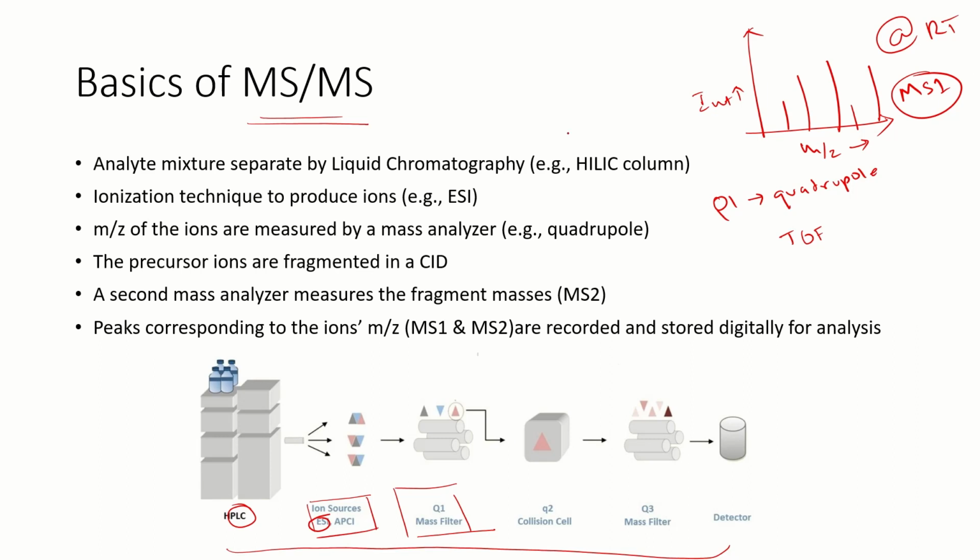So next, in tandem MS, the next step is the fragmentation of the peaks. So we fragment one peak. I'll just take an example of this peak. Let's call this peak X. So we will take X, and suppose this is a molecule somewhat like this, CH, and there's some CH3, there's a benzene ring. So we will fragment this.